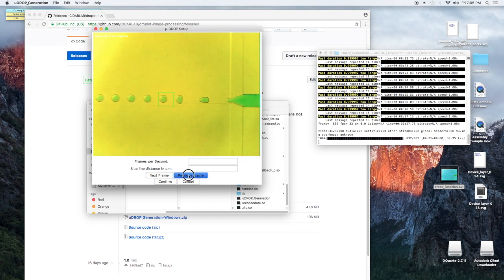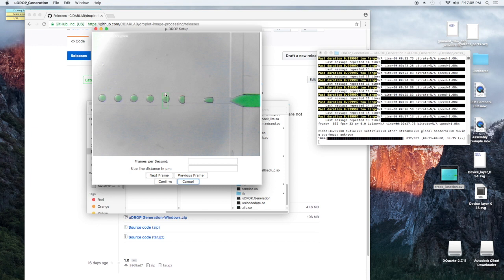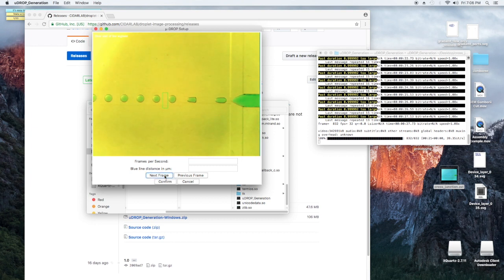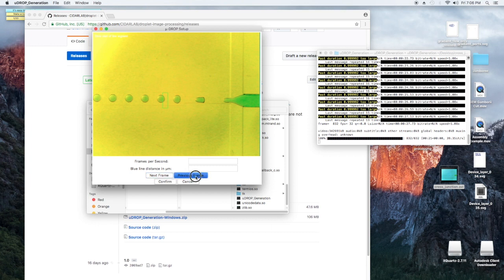So ideally, when you draw the bounding box, you're only going to want it to be centered on one droplet. And to be honest, we only need to take the droplet's diameter, so this is like the only part that we need. We don't need to see the whole droplet. So you can cut it so it only shows a part of the droplet, which might give you better values. The important part is you scroll through here, and you make sure that every droplet gets its time in this box. So it looks good. That looks like a good bounding box to use.